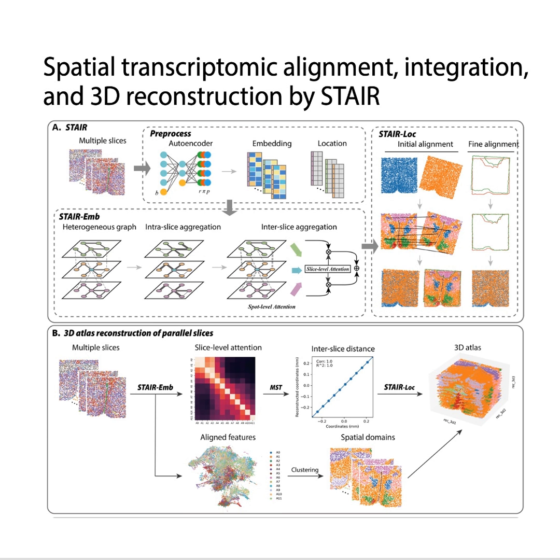That's a great analogy. When researchers use spatial transcriptomics, or ST, to map out an organ, let's say a brain, they can't just analyze the whole thing at once. Yeah, it's far too complex. So the standard protocol is slicing the organ into these incredibly thin, parallel 2D sections. You can almost think of it like slicing a loaf of bread, right? Where each slice holds the gene expression data for its own little X and Y coordinates.